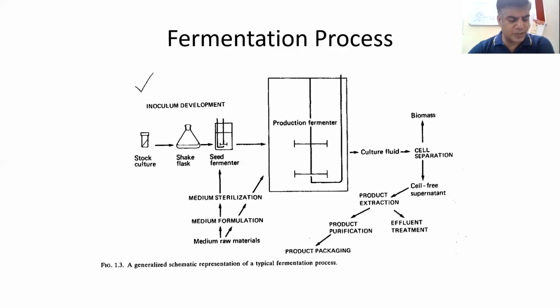The basic functions of the fermenter are long-term operation with aseptic condition, adequate aeration and agitation, low power consumption, control of temperature, control of pH, sampling facilities, no excessive evaporation that loses the watery content, minimum use of labor, suitable range of operations, ensuring smooth internal spaces, similar geometry at both smaller and larger scales, and most important, the cheapest material we can use, and adequate service provision.